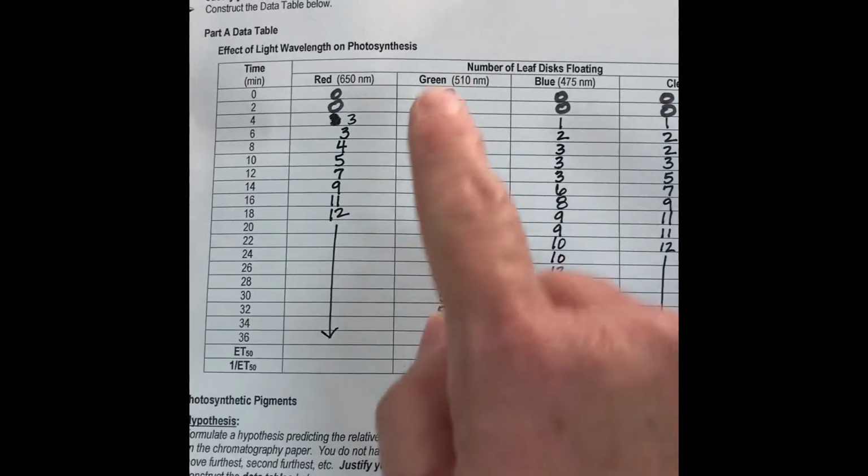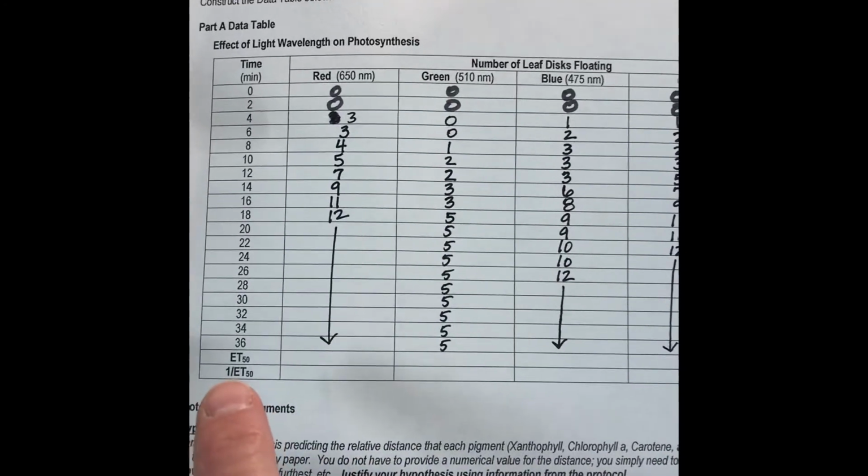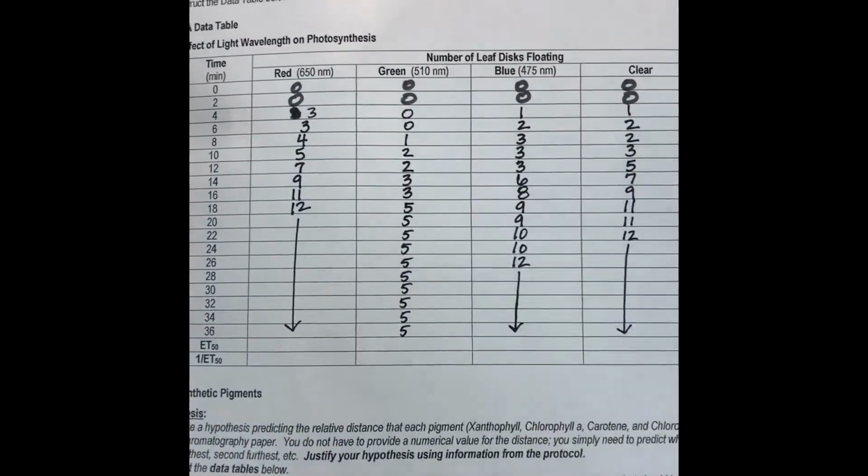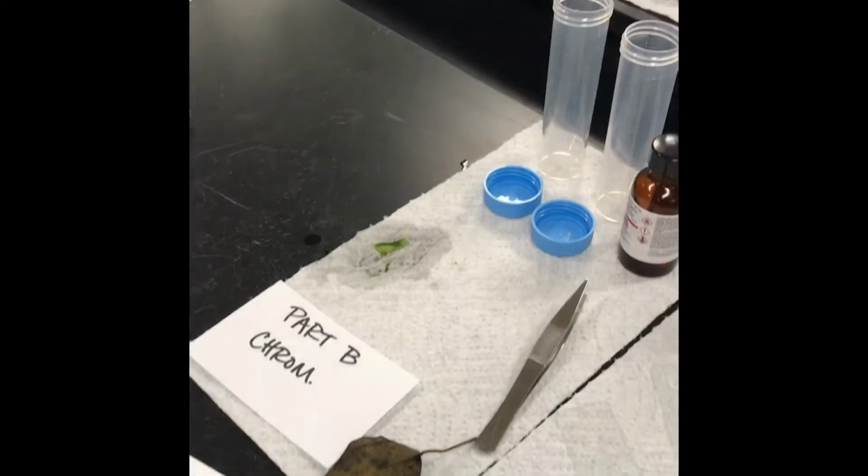So you have to do this one, calculate that, and then the bottom is do the inverse of that. Take your calculator, 1 divided by ET50. And that concludes part A. That's a pretty good line.